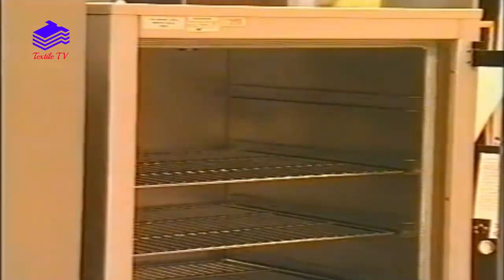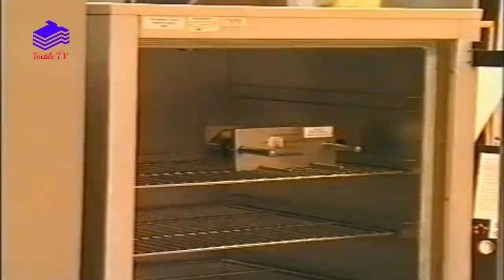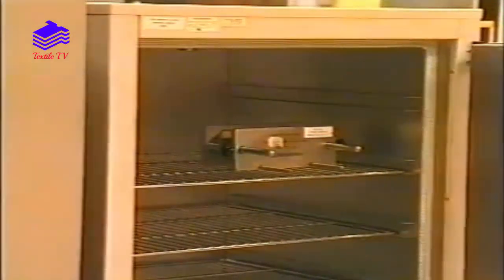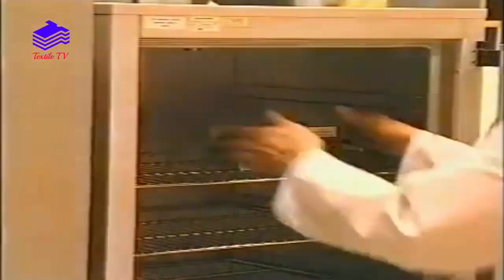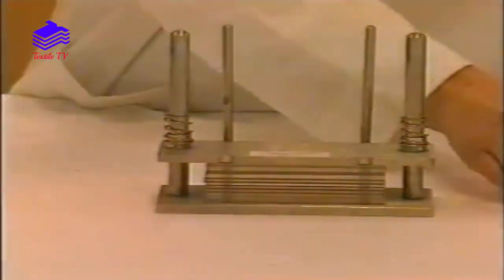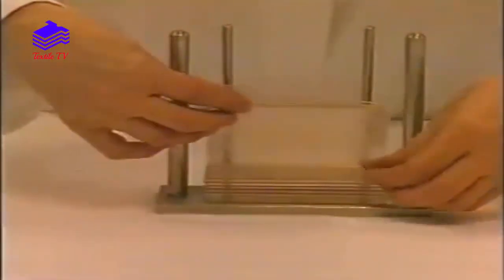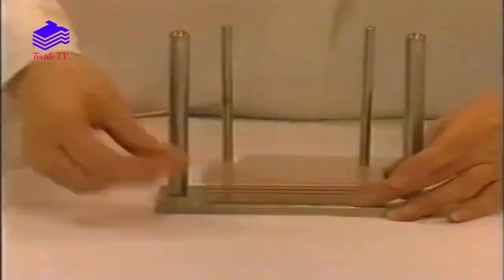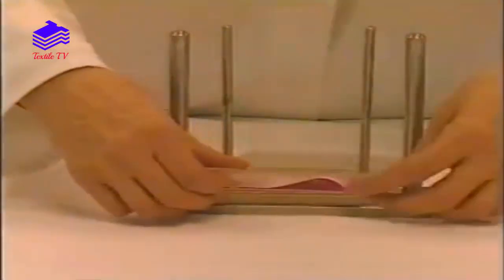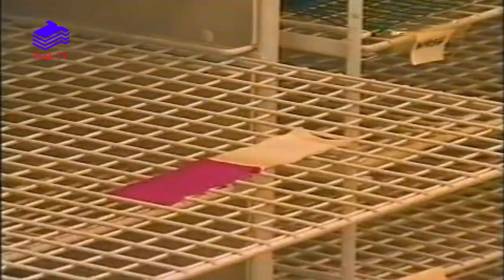The complete unit is placed on its side in an incubator at a preset temperature for a specific time. The units are then removed, the top plates released, and the composite test specimens removed and laid out on the drying racks with the specimens not in contact with the multifibre strip.